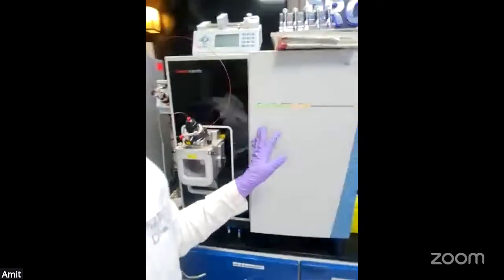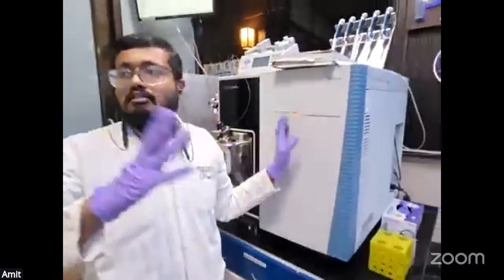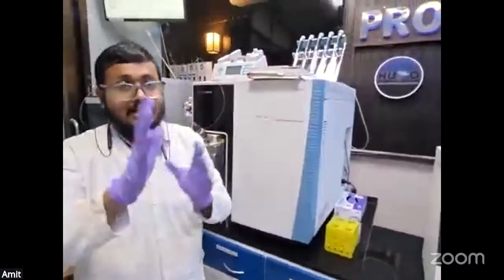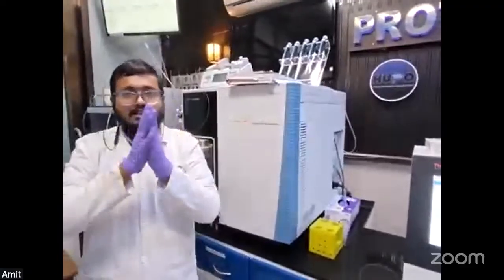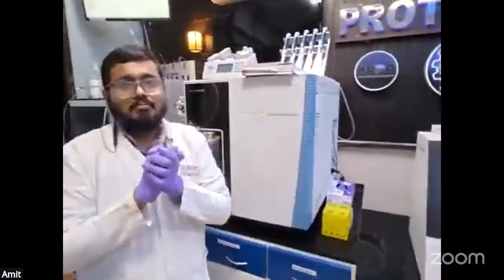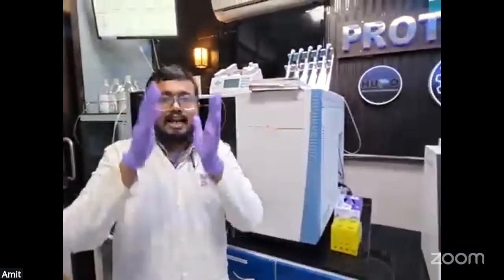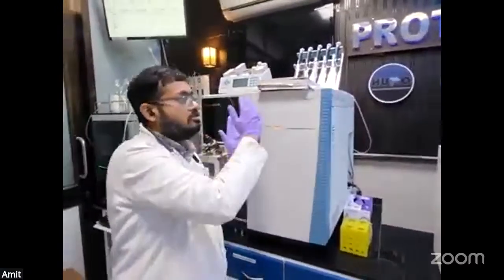Now, what is the major difference of the triple quadrupole mass spectrometer? Here we are talking about different mass analyzers. Just focus on the name, triple quadrupole. But it is not that there are three quadrupoles, so don't be mistaken by the name. It contains two quadrupoles, and in the middle is one collision cell.